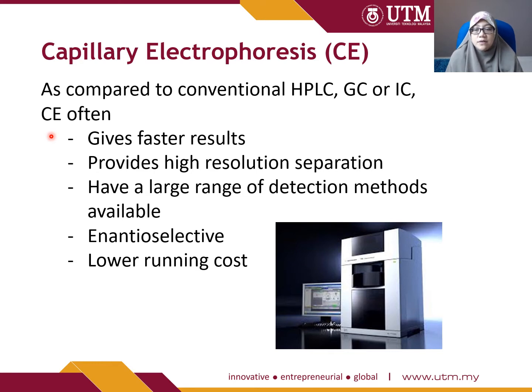For example, case gunshot residue, lepas tu kalau minyak-minyak semua dia akan pergi ke GC. Tapi kalau gunshot residue ataupun benda yang melibatkan ions, very small quantity of analytes, they will prefer to use CE. Okay, why? Because these are the advantages of CE.